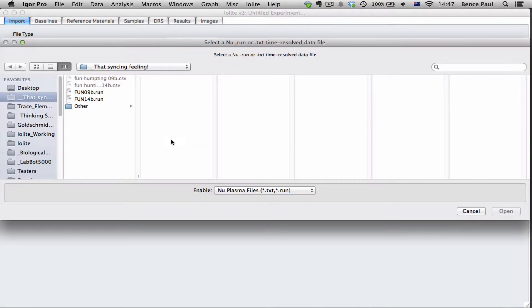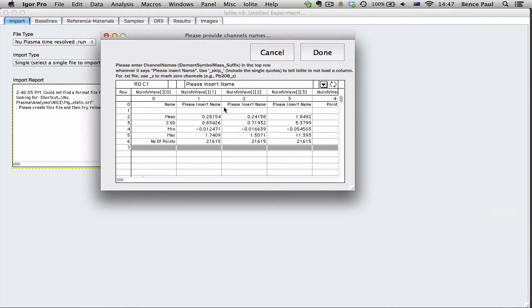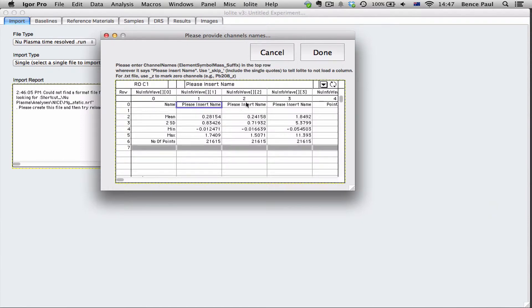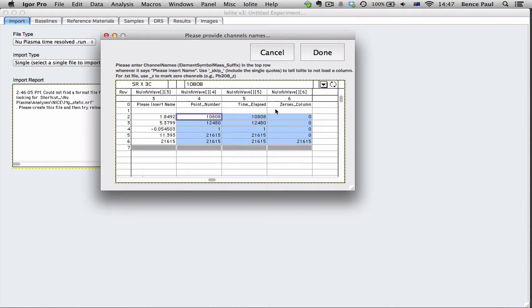in this control here that says the new format file, if we click new it'll ask us to select one of our .run or .text time resolved data files. So if we click on one of our runs it'll bring up this table and in this table it's asking us to name the columns that we see in our .run file.